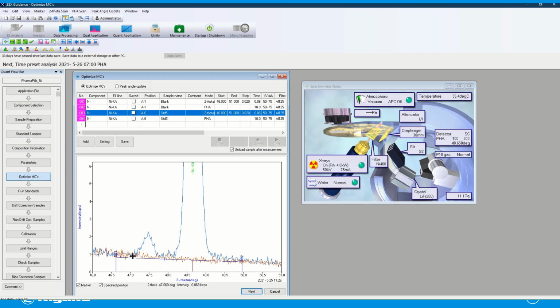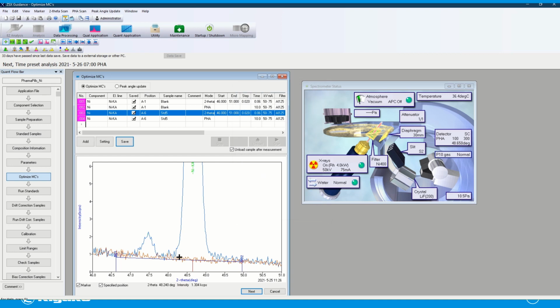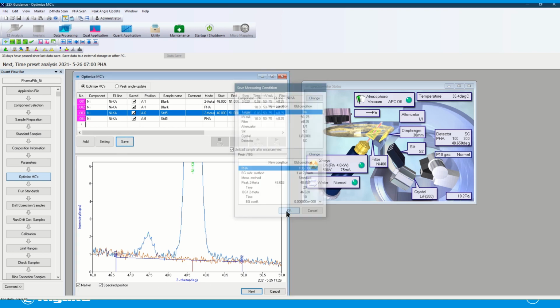So if I want to go down to sub ppm, now that's not a worry for the pharmaceutical application, but for other ones where you're trying to really get down to sub ppm of nickel, you're going to want to build that type into the calibration. So all I'll have to do here is accept those results for the background points, and then we would optimize where our peak position is. It'll look at that scan, it'll put the peak position in, and we'll just save that as well.